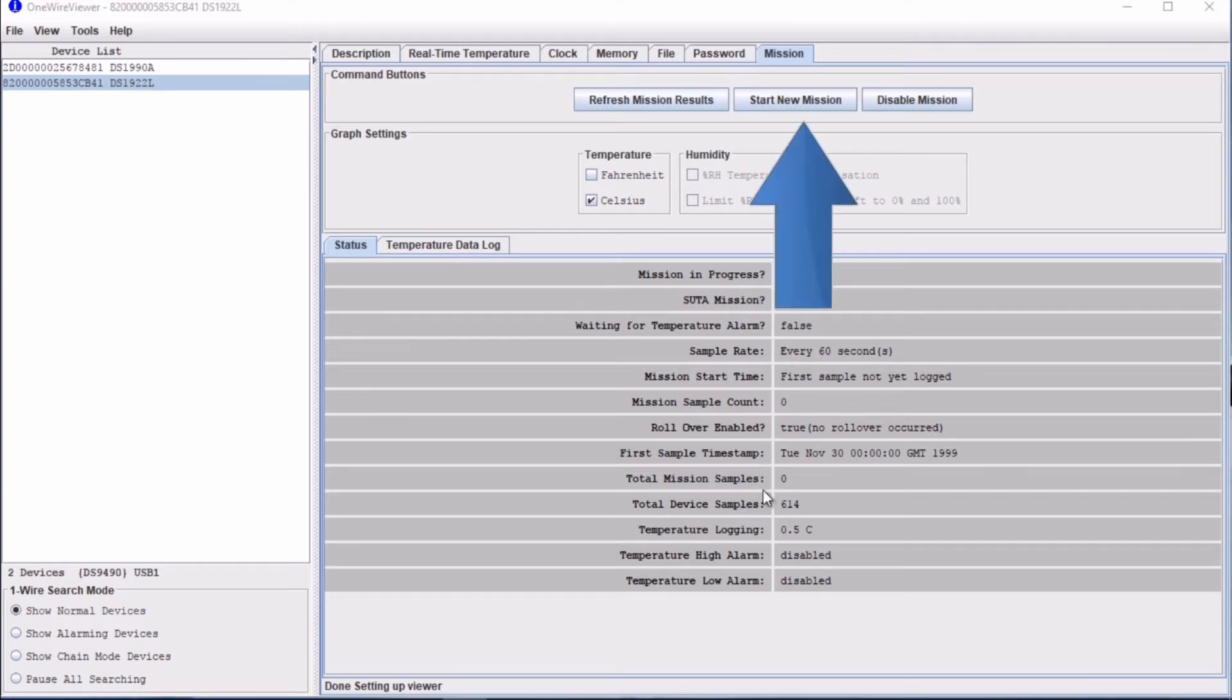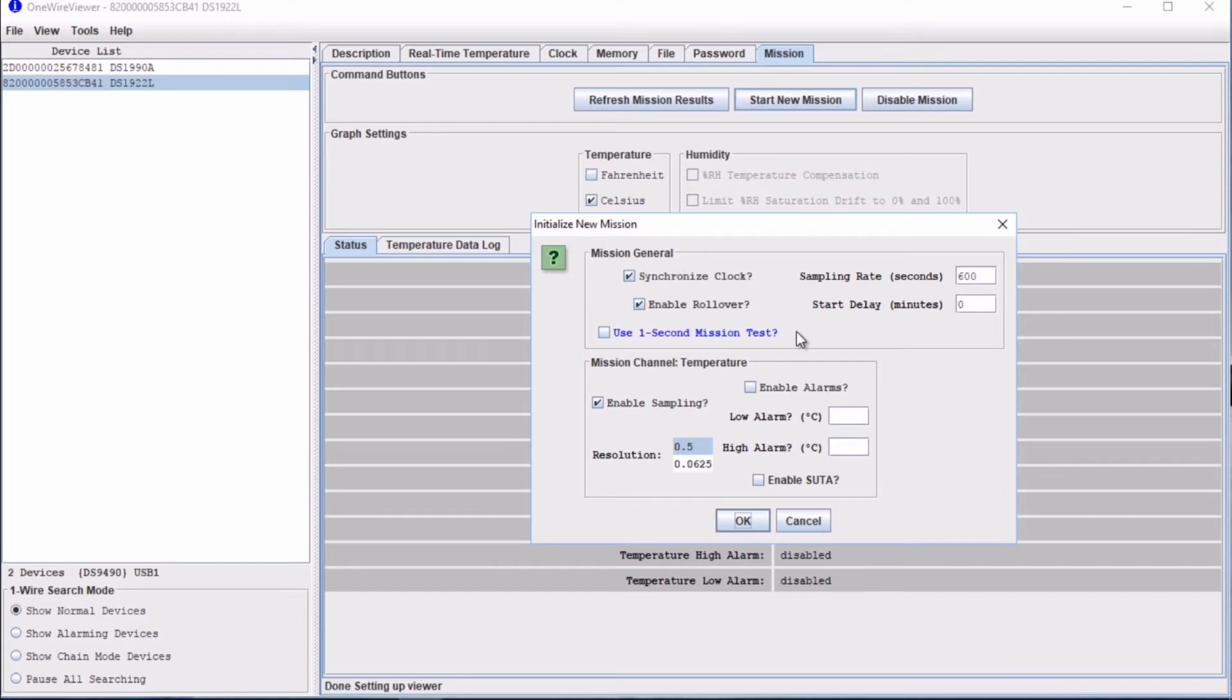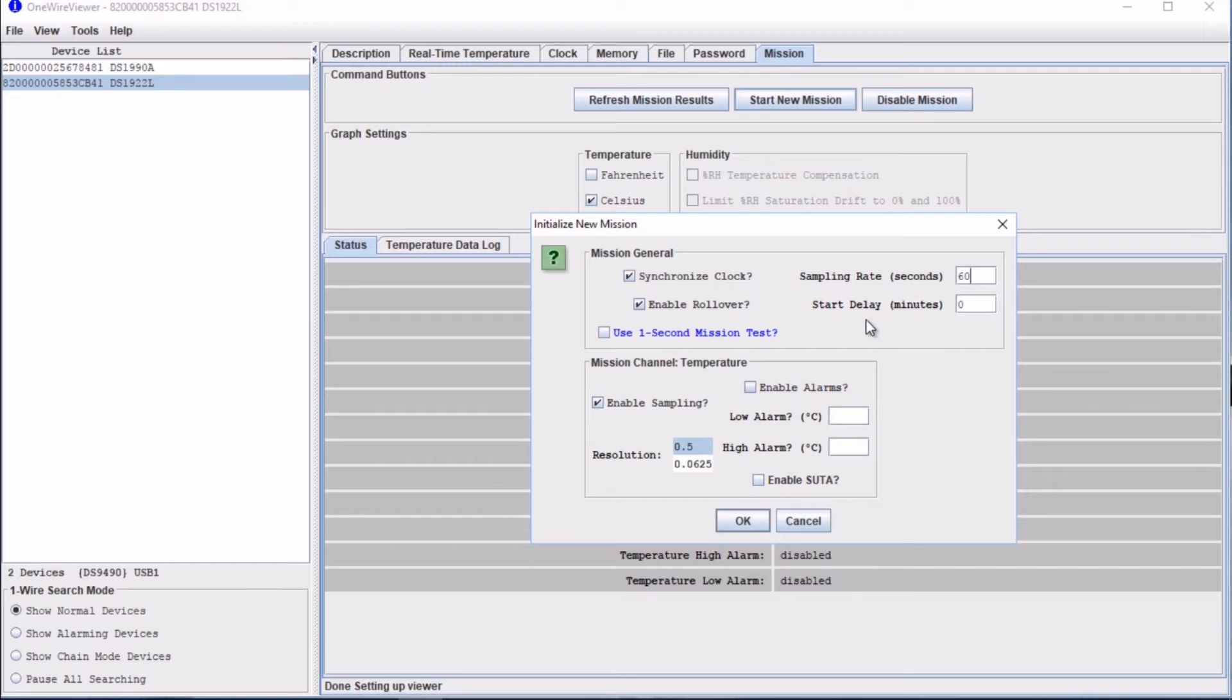To start a mission, we click Start New Mission up here. This window pops up where we have to fill in our desired parameters. These include sampling rate. We will take a measurement every 60 seconds. We won't create a start delay or temperature alarm, but we can see here that these functions are also possible. There are other boxes here which you must decide whether or not to tick.